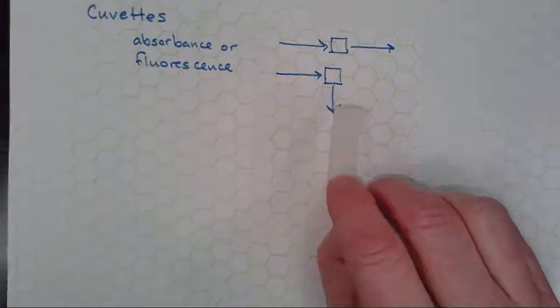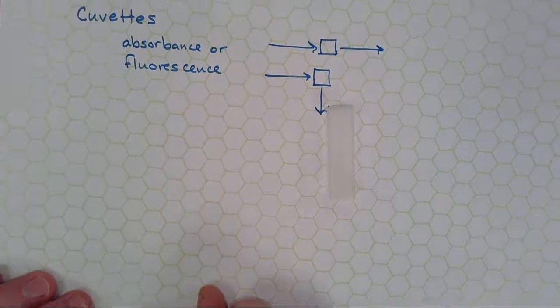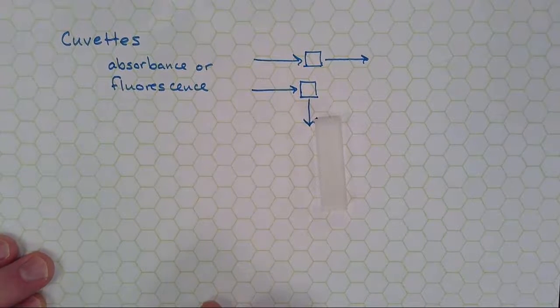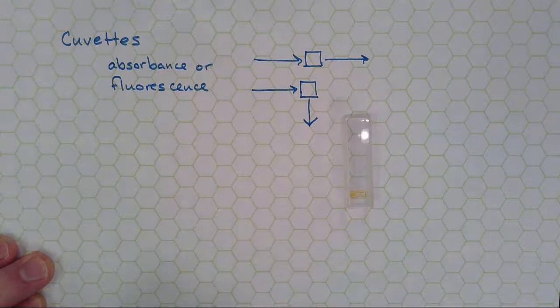We have some other cuvettes. With this one, can you see how that side is cloudy? I should tape down my background so that I don't move it around like that. That's going to be dizzying. If we flip it 90 degrees, that side is clear.